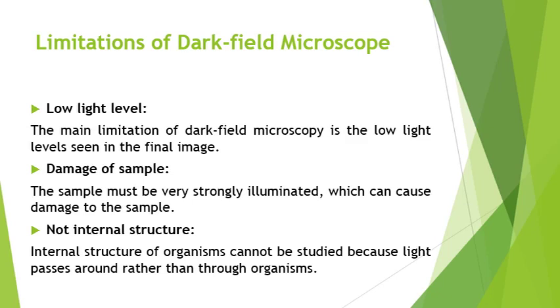Sample must be very strongly illuminated, so it may cause damage to that sample. And the last one is that we can't study the internal structure of an organism through this dark field microscope, because in this microscope light passes around the specimen rather than through the specimen.